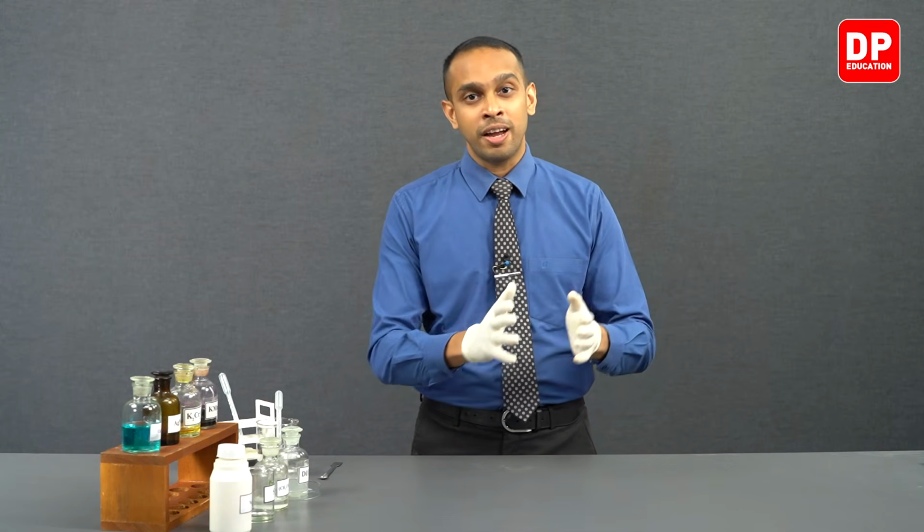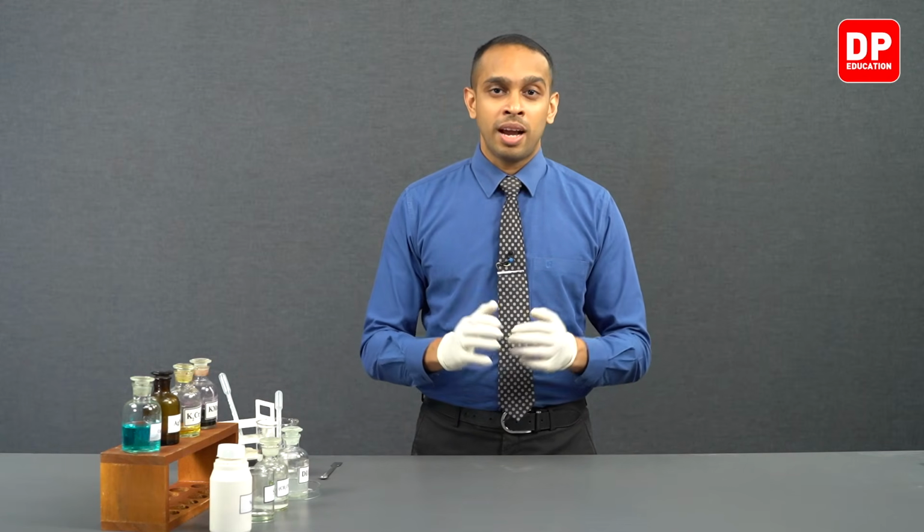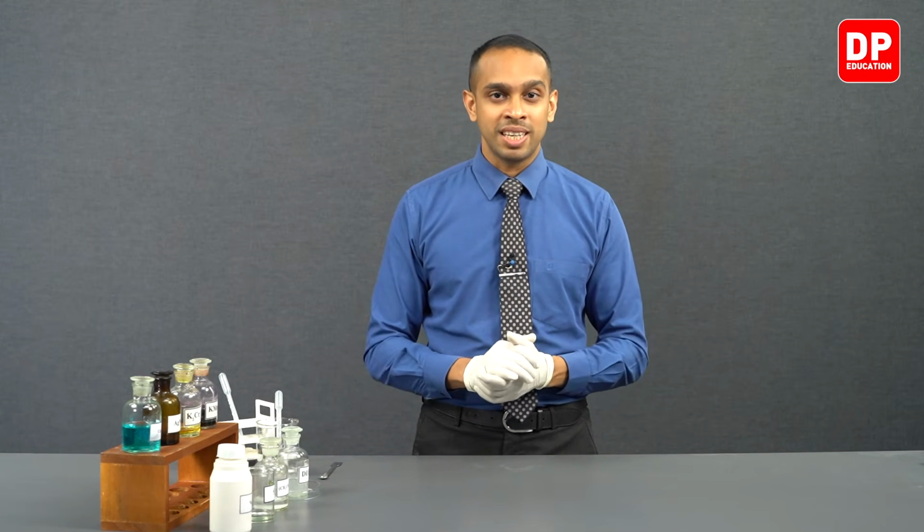Colloidal sulfur, or solid sulfur, was formed when we sent hydrogen sulfide through acidified potassium permanganate. Therefore, due to the formation of this solid sulfur, we saw the solution turning milky. The solid sulfur that is formed was dispersed throughout the aqueous medium and turned this colorless Mn2+ aqueous solution milky.